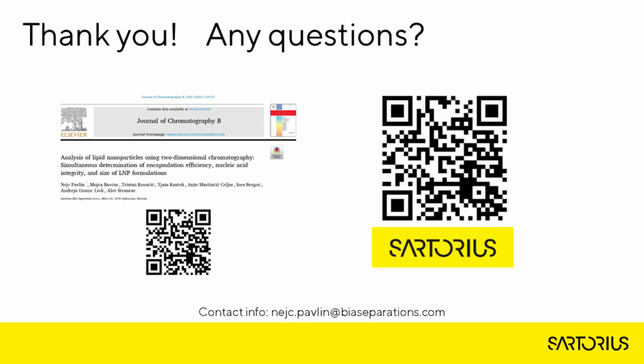The second process is really a strong interaction of particles with the SDVB column.